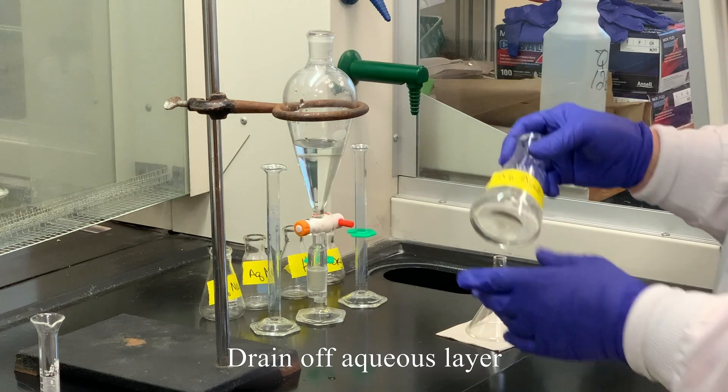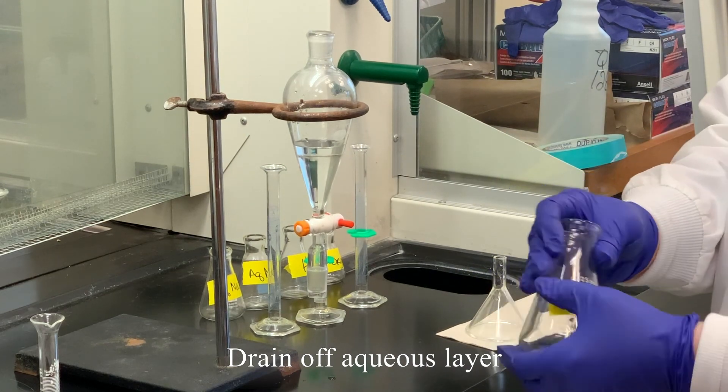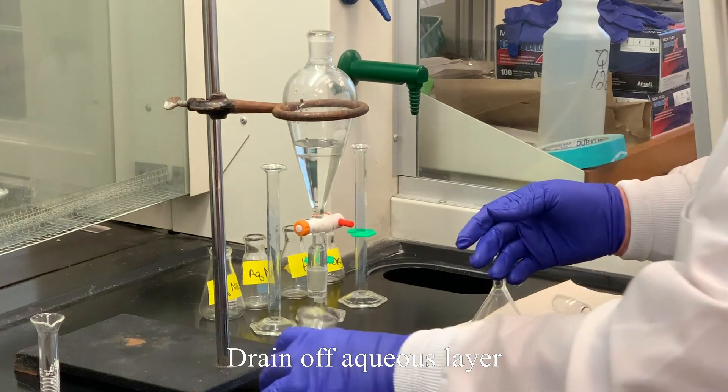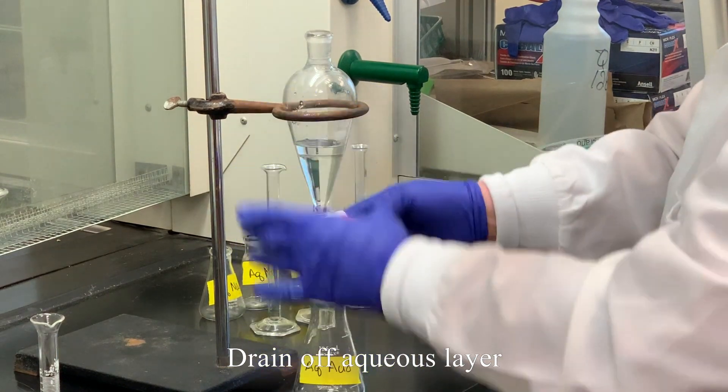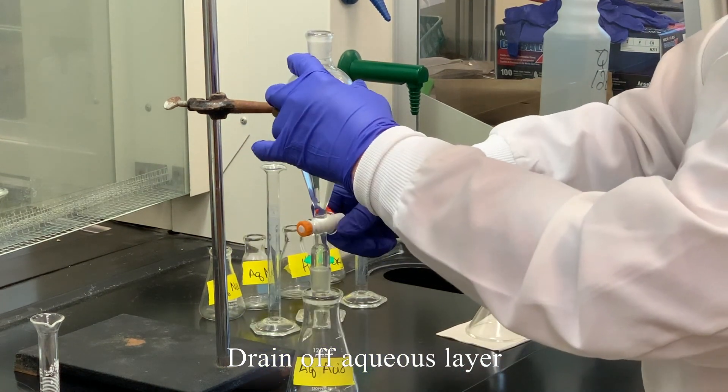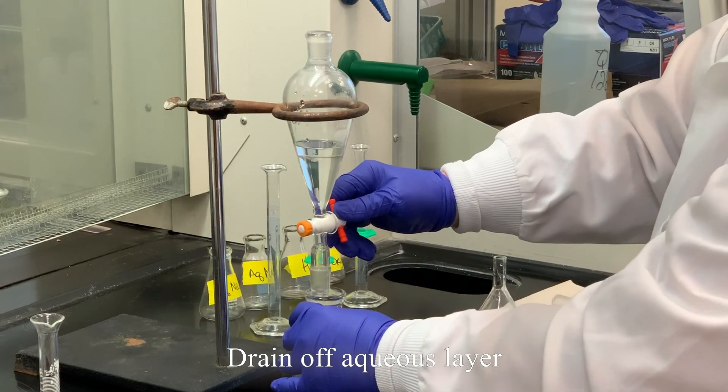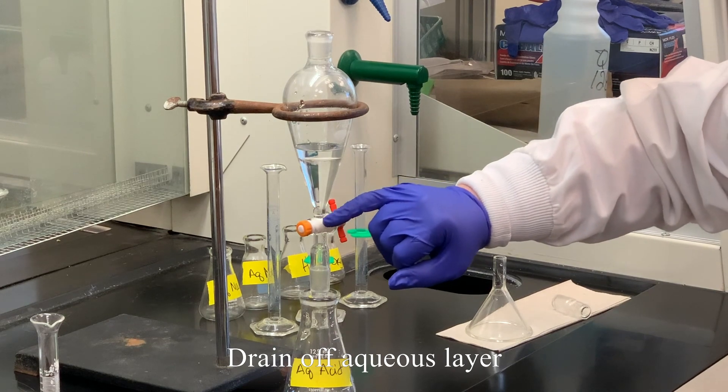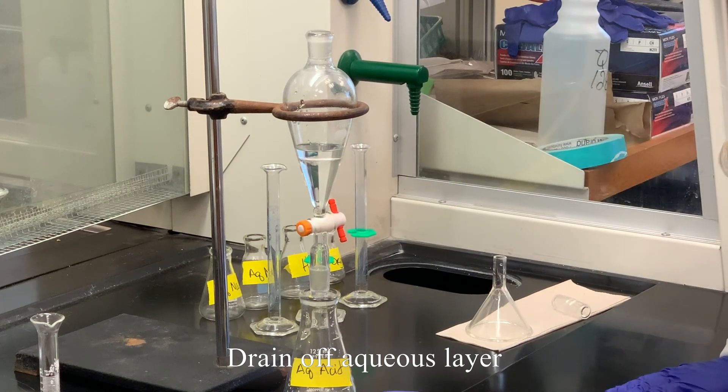So I can put my flask. I went ahead and labeled these flasks so there's no confusion. So this is the aqueous acid, which is this bottom layer. And then I'm going to drain this until the layer gets almost flushed with the white stopcock.